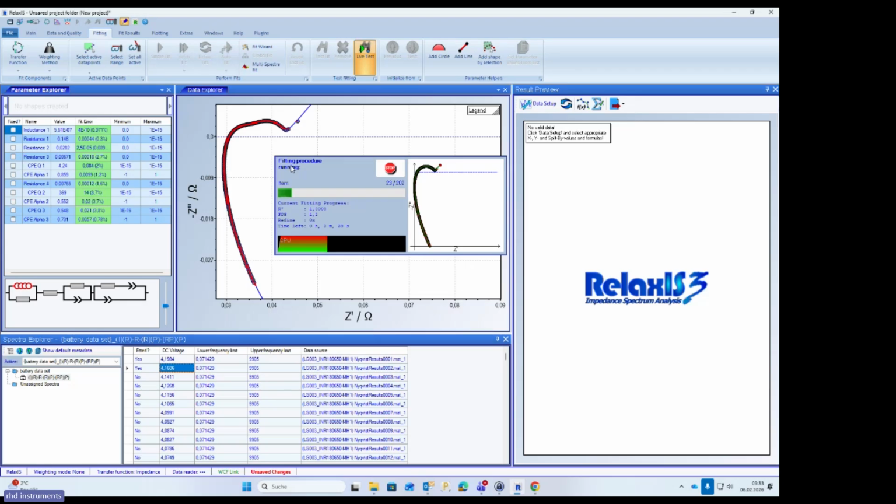And the maximum number of data sets I have used so far had 80,000 battery spectra. This took quite a while, but it was running through this fully automatically, which is quite useful. Once this has been done, I want to show you what you can do with the fit results. So we are almost at 25% of all spectra. You see here the counter, it's now 60, 61, 62, and so on.